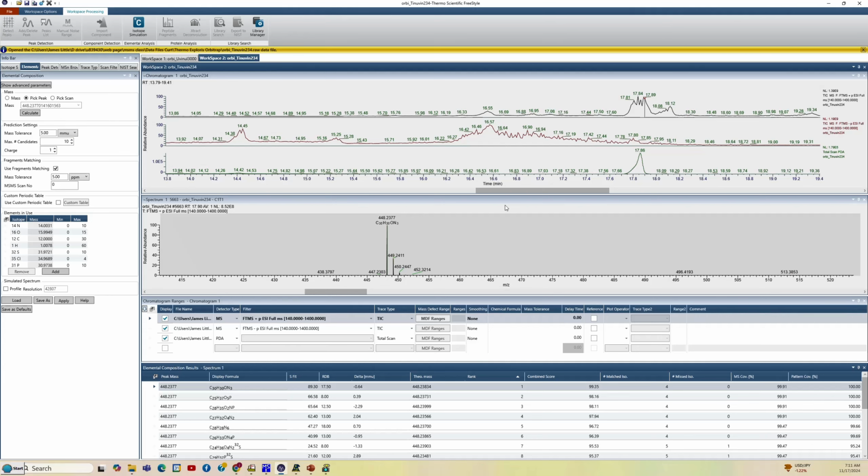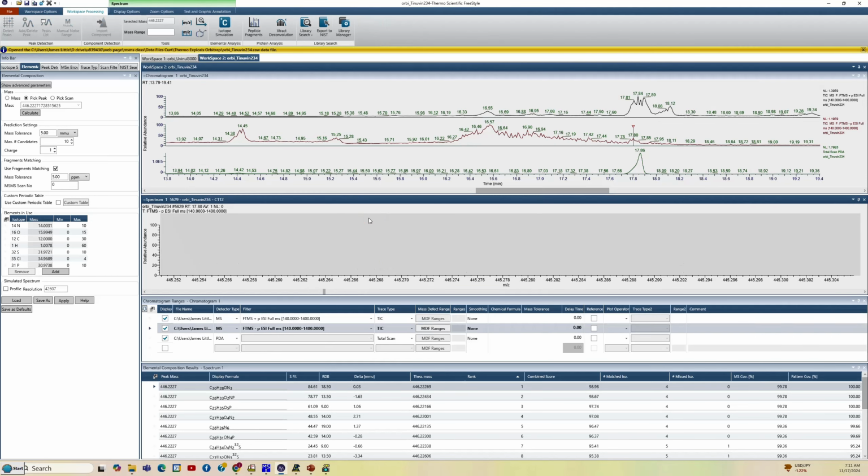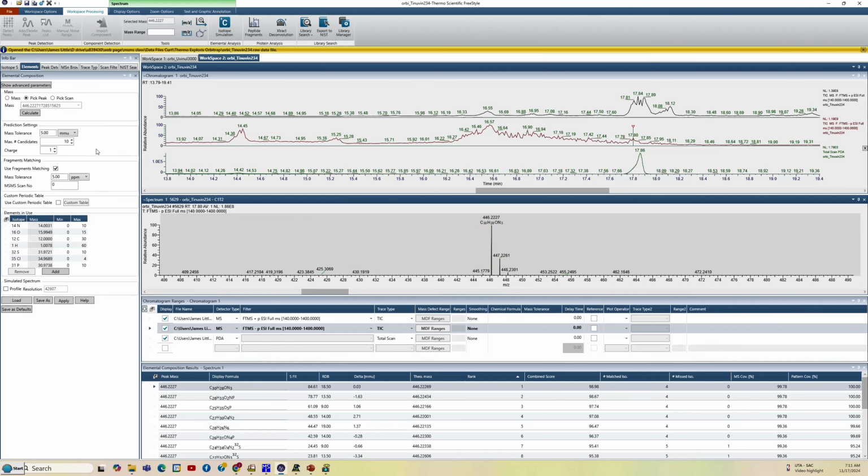So let's see if we can get some corresponding data from the negative ions. So I'll click on the negative ion chromatogram. You can see the 446. Click on it to bring it up. Rescale it. I just clicked on the wrong thing. So I'll go up here, and I've got what I want. Peak picking. I'll pick the 446 ion to accurate mass and say calculate.